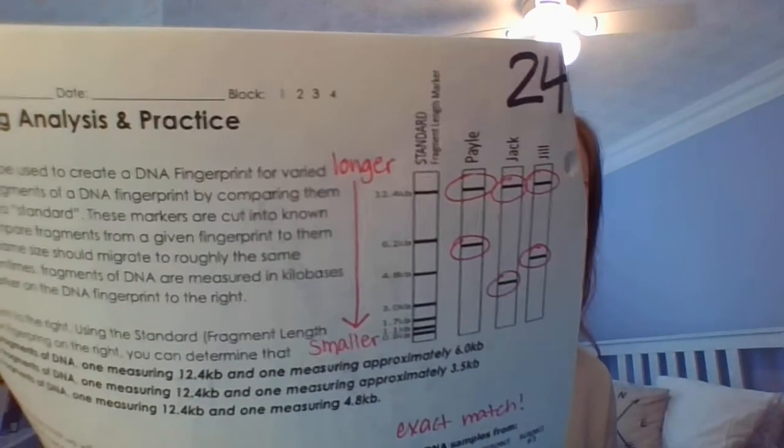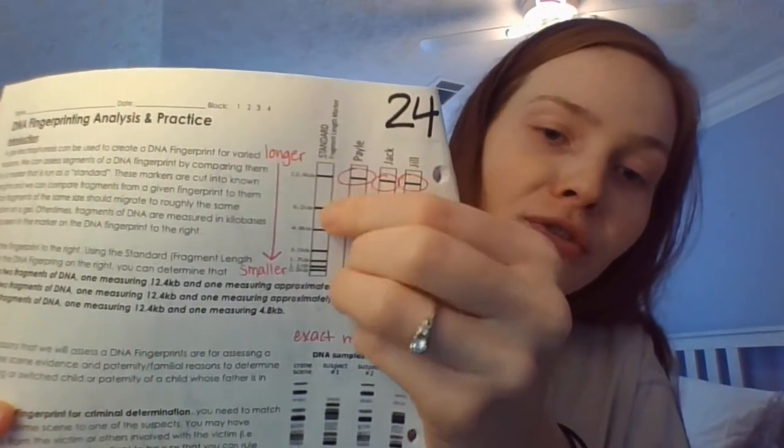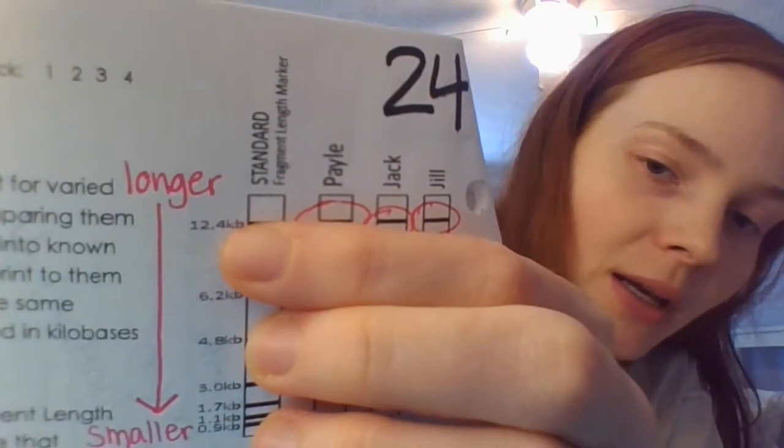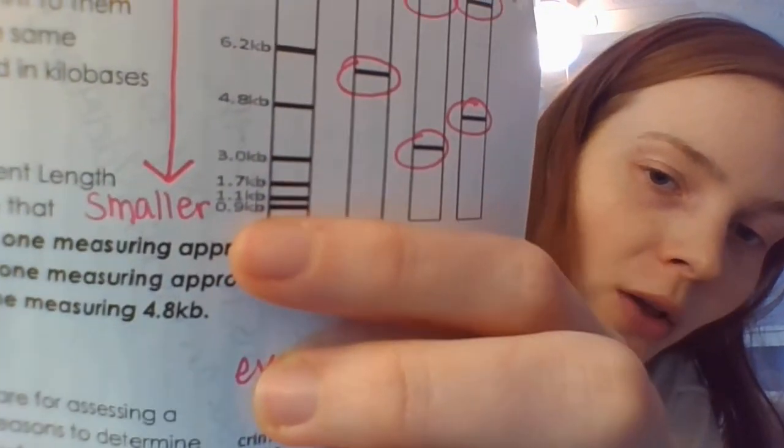Okay, so let's look at the first part, the introduction. We're at this image right here. Okay. I want you to notice the standard. There is something called a standard. That is just a bunch of fragments that have been run, so you know what they are. So you know that this fragment at the top is 12.4 kb. The one at the bottom, which you're expecting to be much smaller, is 0.9 kb. Okay? So that's just kind of a standard or a marker that you use to determine the lengths of your other fragments in your samples.